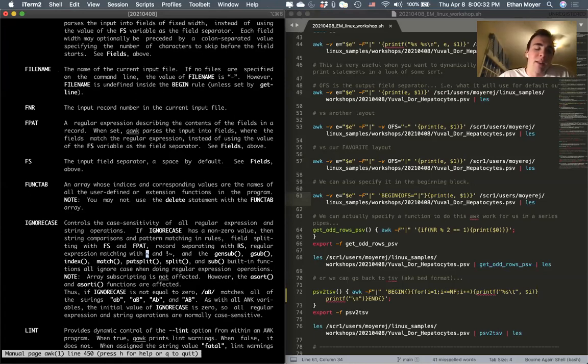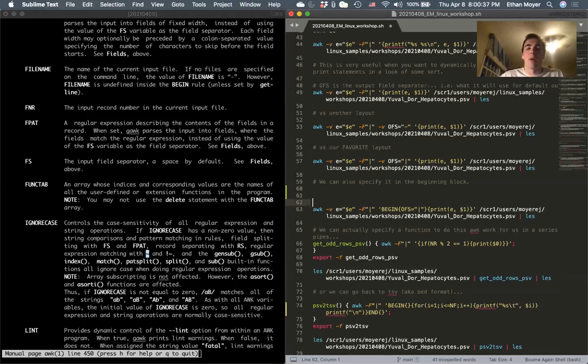And it also uses this utility, which is a way of doing kind of like a grep. And a grep is a Linux command that matches a string to a regular expression, and a regular expression is a way of generalizing patterns. So for instance, in awk, you would have: if the first line contains CG, you'd want to print it, right? And that's how you can use the tilde to do it.